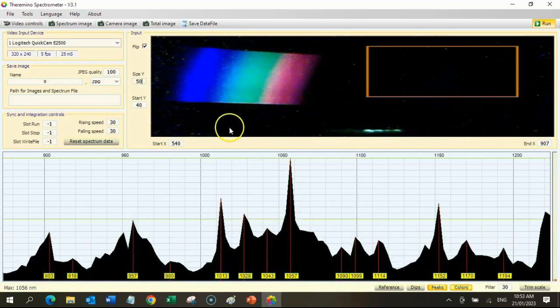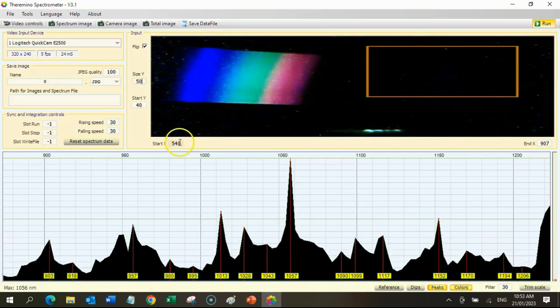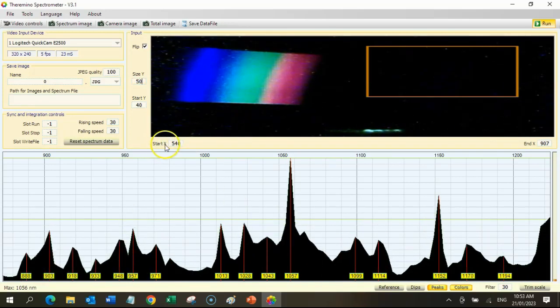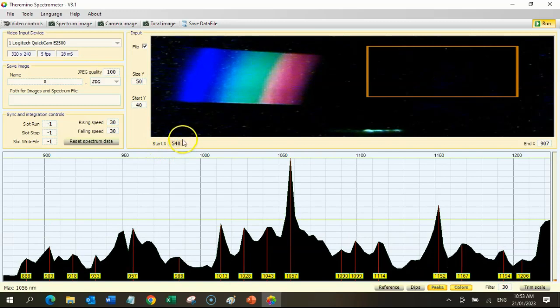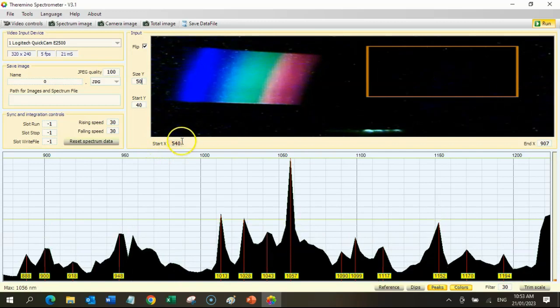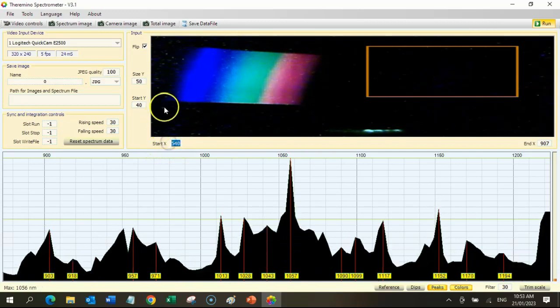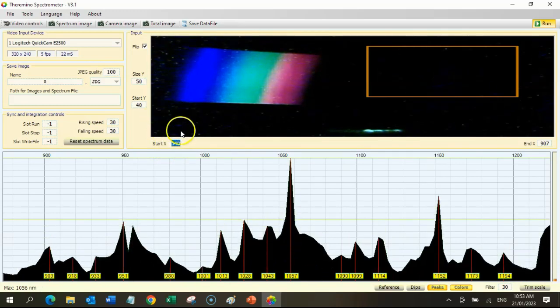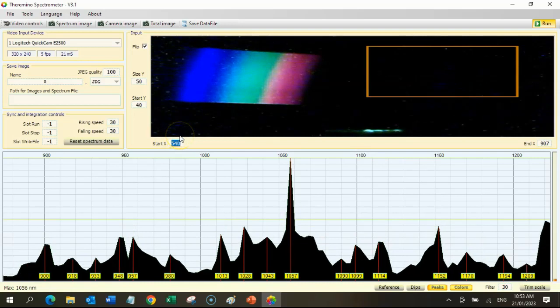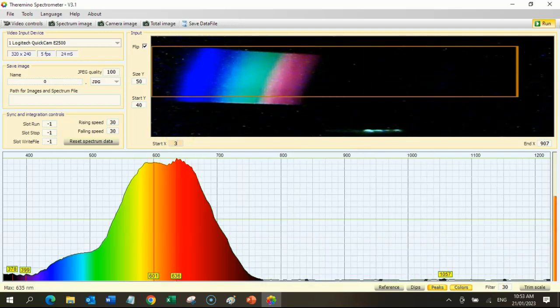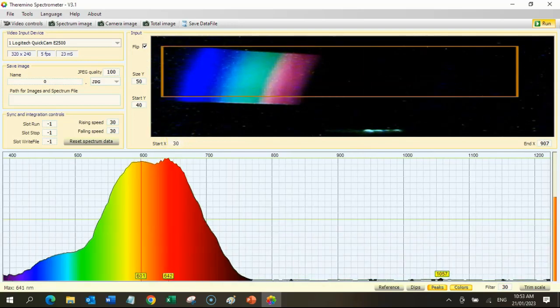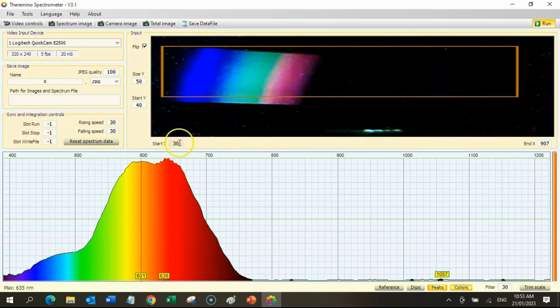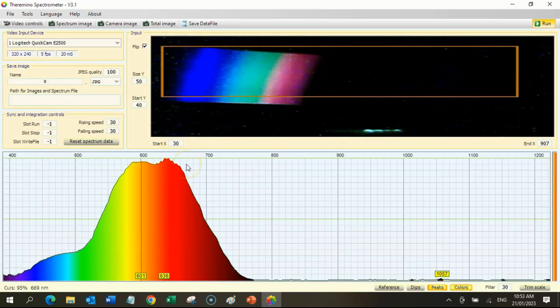For the width of the frame, go to the Start X here. We might set it at 40 and then the End X at about 400. That controls the width of the frame.